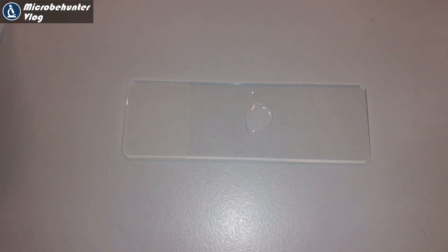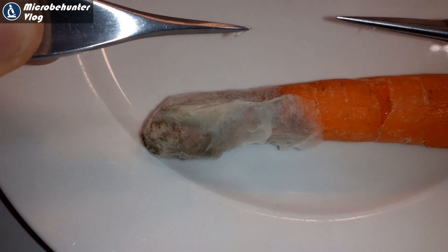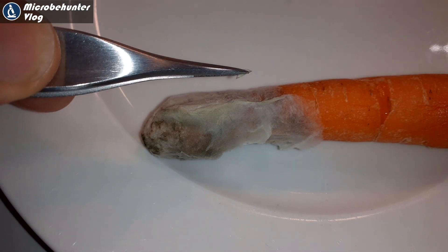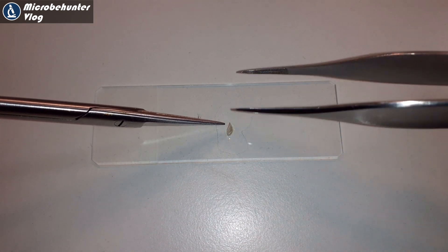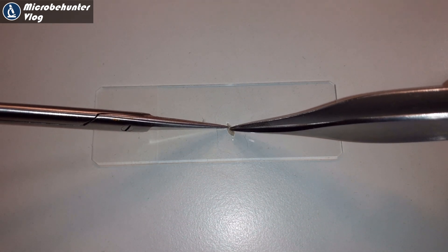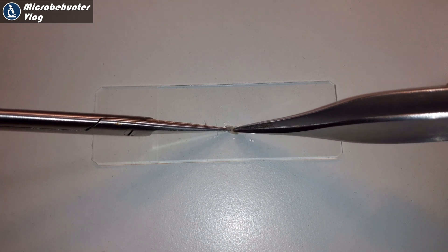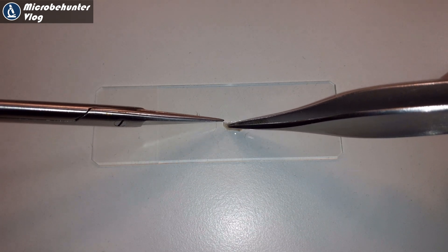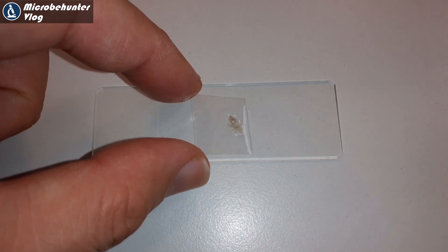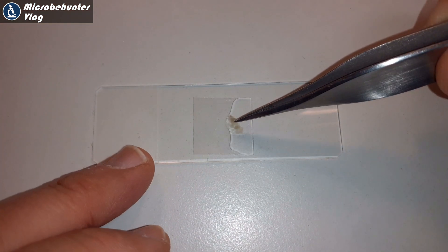I'm now going to put the mold under my compound microscope. I carefully take a small sample — again, not disturbing it too much because I do not want to get the spores scattered around in the air — and I put it into a drop of water. Because it's so dense, I'm carefully trying to pick it apart a little bit so that it's more easily visible under the microscope. The cover glass has to go on top, which also presses everything flat and makes everything much easier to see.